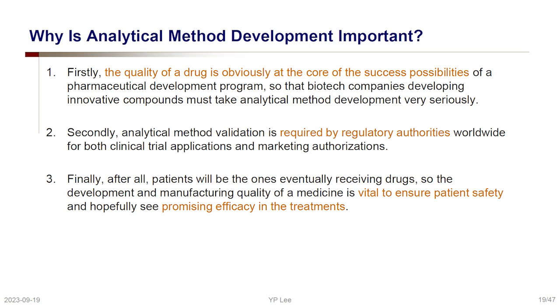Then why is the analytical method development such an important thing to do? Among others, the quality of the product can be assured with a good analytical method, and the data need to be generated to support the quality of the product, and that data can be generated by the analytical method. And of course, this is required by the regulatory authority, which is related to the approval. And not only that, the data from the analysis is critical and vital to ensure the safety for the patients and prove that there is an efficacy for the treatment.